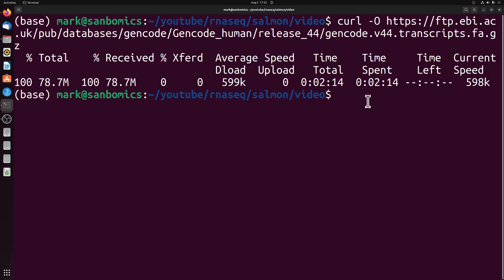Once that's done we could theoretically make the index just with that, but we're going to add decoys to our index to make the mapping more accurate. It might be a little slower, but it's by far worth it.